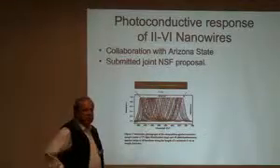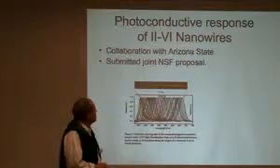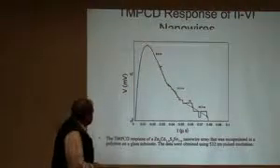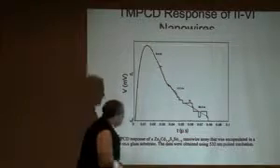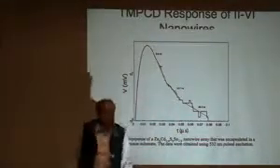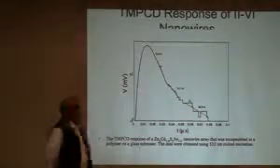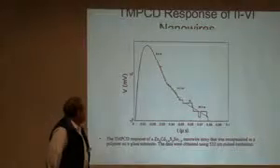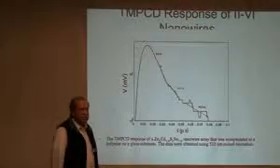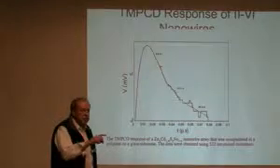Well, we decided to take a look at the photoconductive behavior of these materials. And our first shot with the TMPCD, and we only have one, this was done at CSM, we only had a 532 nanometer YAG laser for excitation. But we did get quite a nice photoconductive signal out of this. And again, we can see 3 distinct lifetimes here. So there are a number of things going on here. This might be variation of the lifetime as you go along the wire.